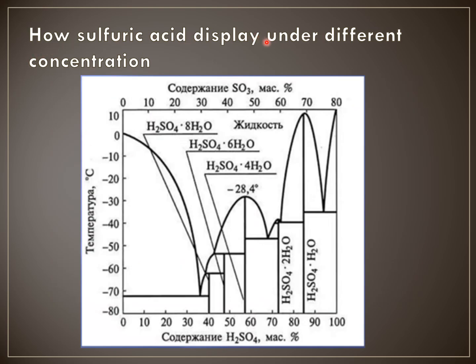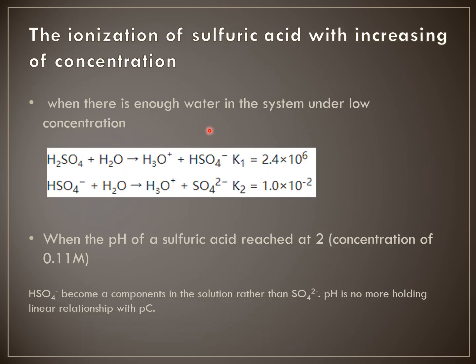Coming to the phase diagram of sulfuric acid, we can know exactly what the components are under different temperatures. You can refer to this and check all the details in related books or references for more information. Today we mainly answer the question we mentioned at the beginning of the slide, to clearly know why sometimes you face problems when you detect the concentration with a pH meter.